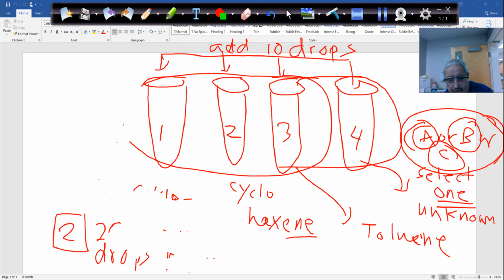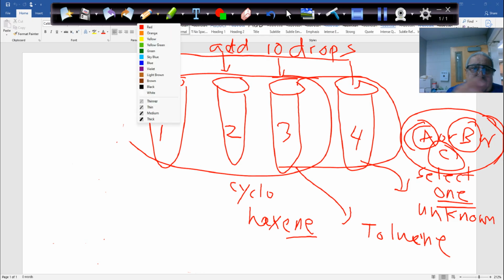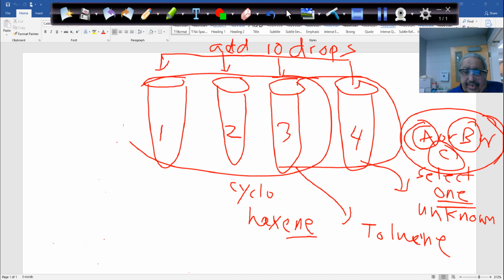I apologize. So then we have two tests to finish. And whenever you are done with everything, we'll do the combustion reaction, the last one. So three types of reaction. We did the physical reactions with solubility in H2O and hexane.